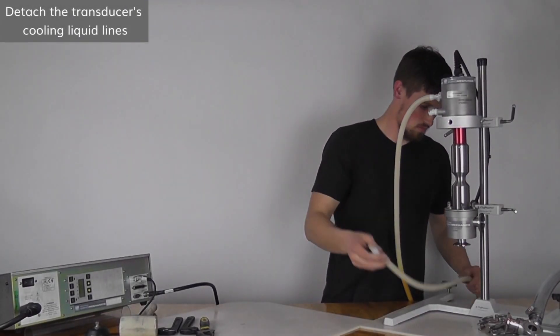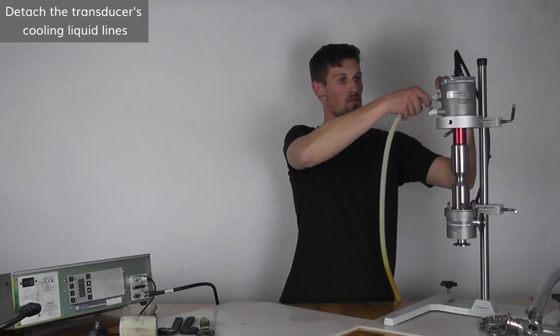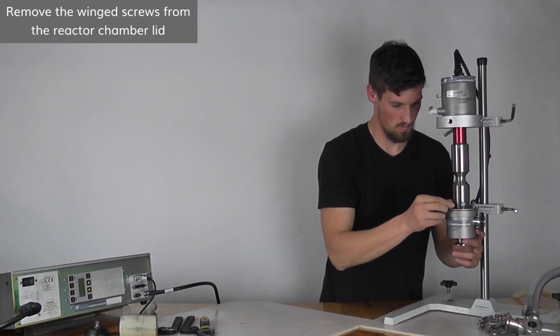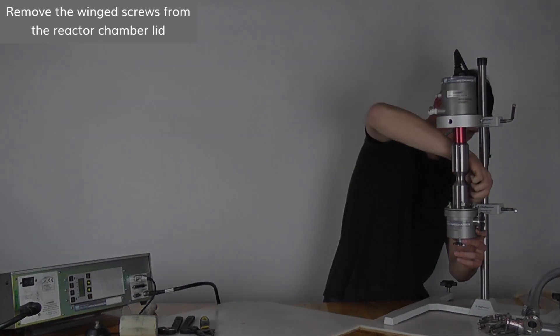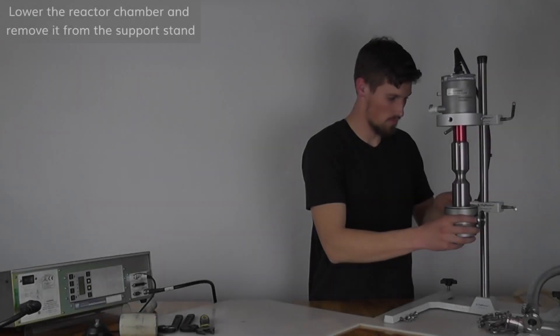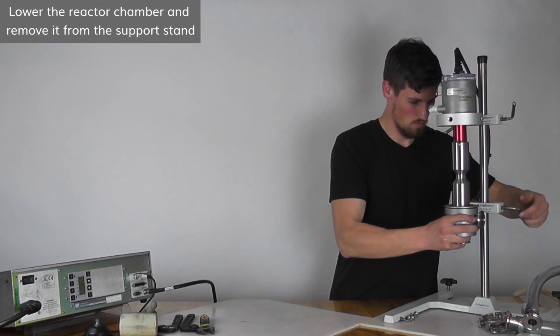Attach the transducer cooling lines. Remove the wing screws from the reactor chamber lid. Lower the reactor chamber and remove it from the support stand.